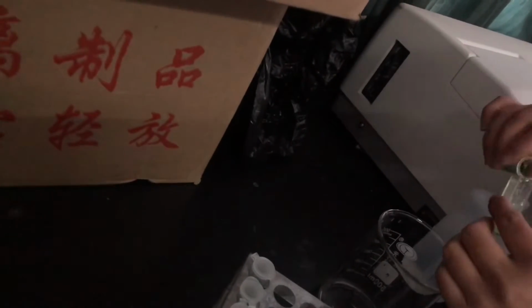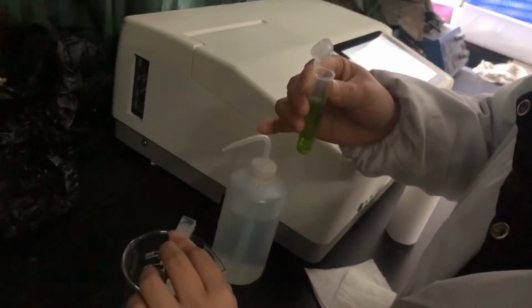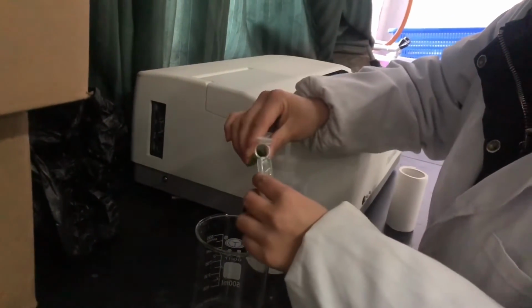And we use this to wash 2 times. Okay. Just every sample we use to wash this, 2 or 3 times. Okay.